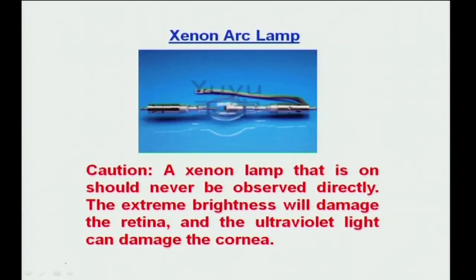Okay. So, again, this is a xenon arc lamp, and the caution with which we end the classes: a xenon lamp that is on should never be observed directly. The extreme brightness will damage the retina, and the ultraviolet light can even damage your cornea. Okay? So, you have to be careful. You just do not go and open up an instrument.